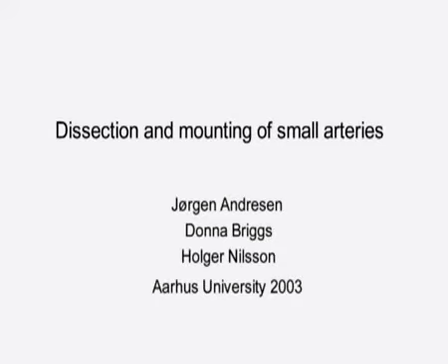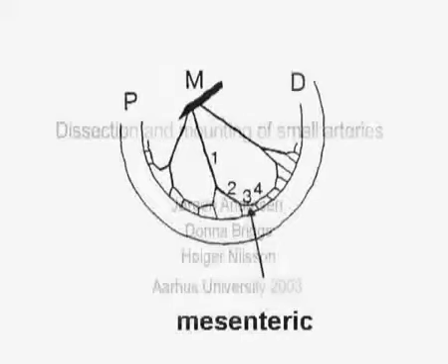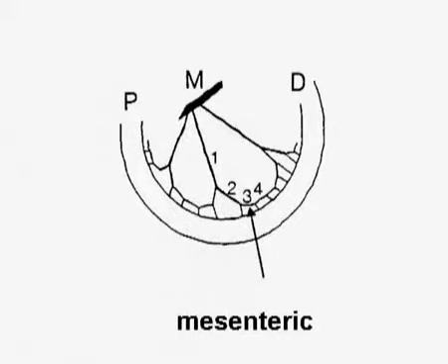This video shows dissection of small arteries from the rat intestine and the myograph mounting techniques. Use this video as an introduction to the techniques and as a visual supplement to the myograph course manual. Using similar techniques, other small vessels and tubular structures can be isolated and mounted. You will succeed with this technique through practice and attention to detail.